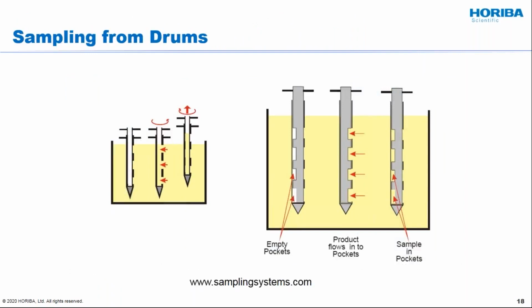So one of the things that you're very, very often confronted with is you have a bag or a drum full of particles and somebody says, what is the size of this sample? Now, what we're illustrating here is what to do when you're handed that drum or that bag or that beaker full of powder. But the whole point of it is this would not really be the way you would be recommended to go.